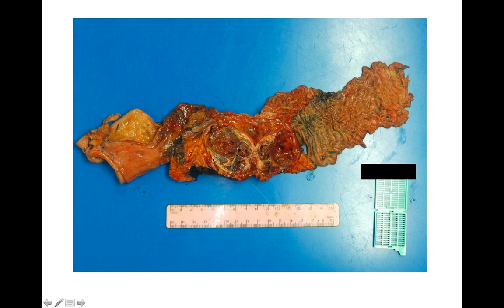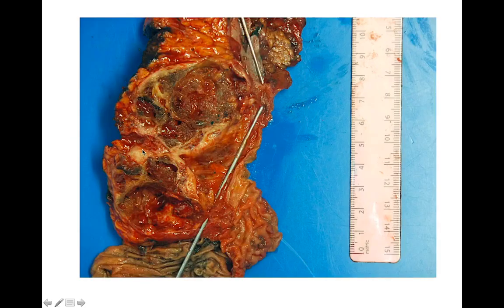And then here we have another specimen, very interesting specimen too. Here it's bivalved. You could see here is the neoplasm right over here, and then here is what appears to be duodenum, and then here maybe some of the stomach. And then let's take a closer look. You could see that this neoplasm is kind of well circumscribed. It has a capsule potentially, but it looks like it's multiloculated or septated, and it's also pretty hemorrhagic inside, and maybe it's quite necrotic as well.